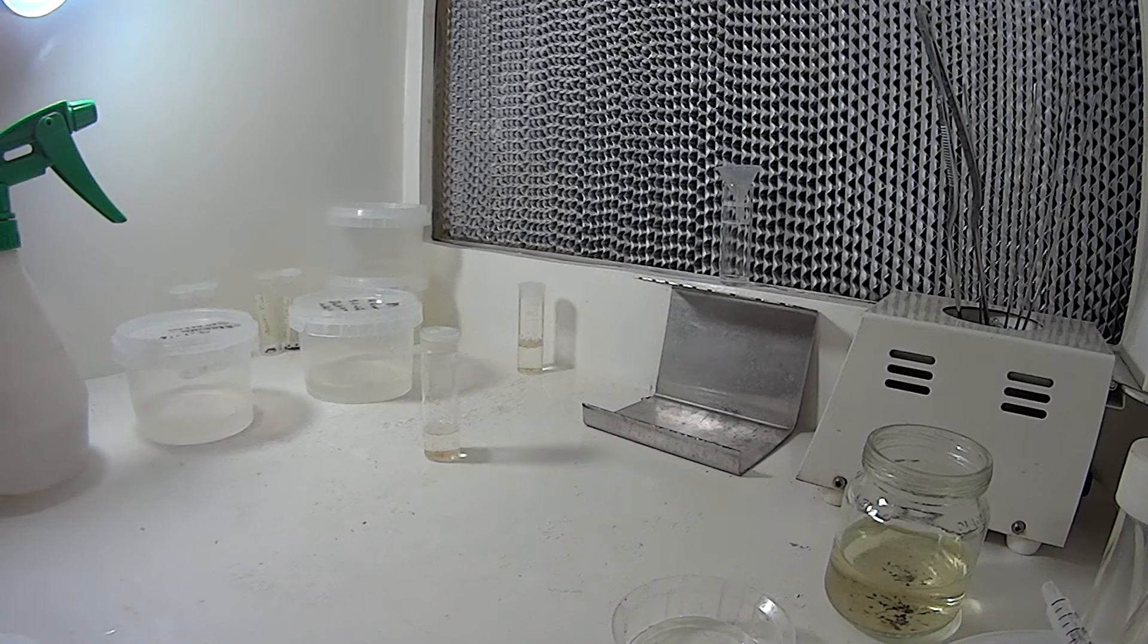Basically, it's 2 mls of plant preservative mixture added to 50 mls of your media. Now the media is before you add anything, so apart from the MS salt, so it's basically water and MS salt - no sugar, no agar, no gelrite, anything like that.